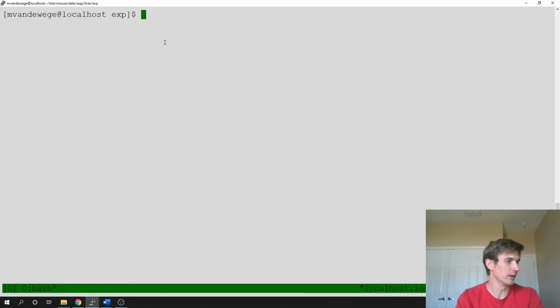I'm going to open up the terminal. The program that we actually call is RSEM. RSEM is a pretty big suite that contains a lot of tools that assist in not only mapping reads. RSEM is going to call bowtie to map reads, but then it's also going to count the number of reads that map to each gene. That's its overall goal.